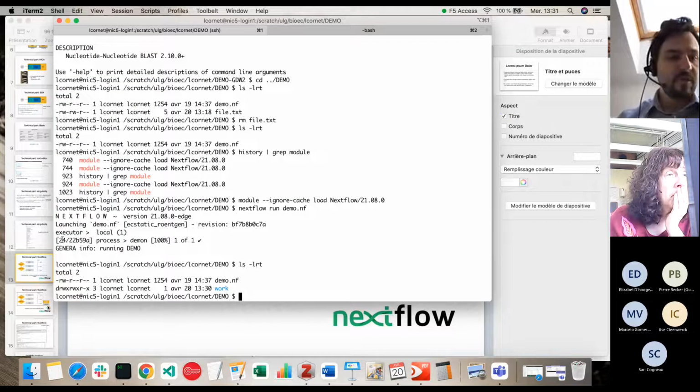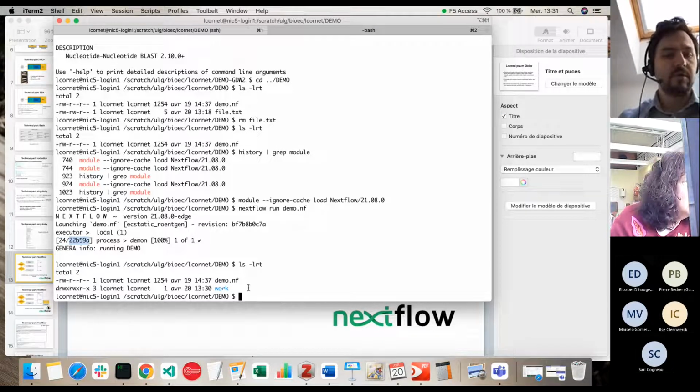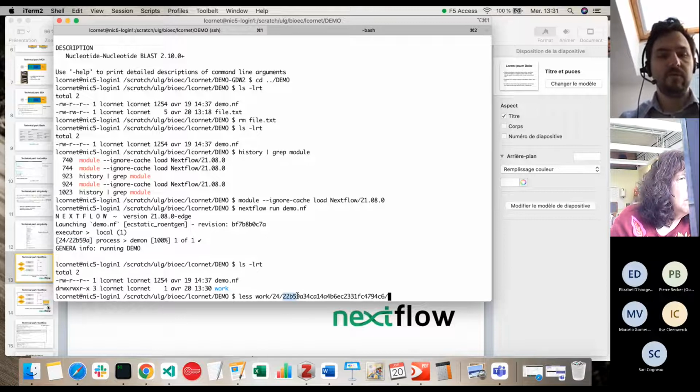And here you have some information, some numbers. It's the subdirectory and the final directory present in the work directory. So let's see what you have here. You see that is the first one. Then you have the beginning here that you can find here. This is where the analysis is actually done.